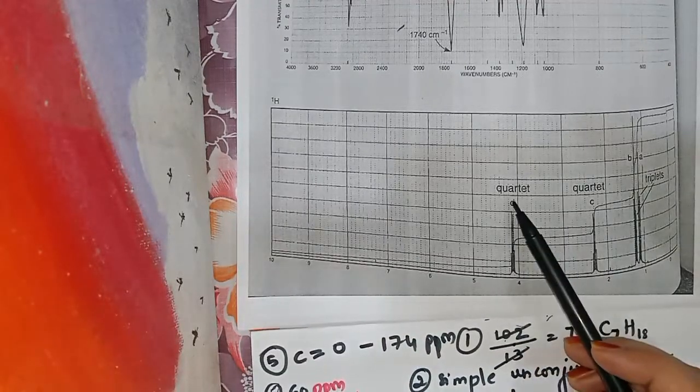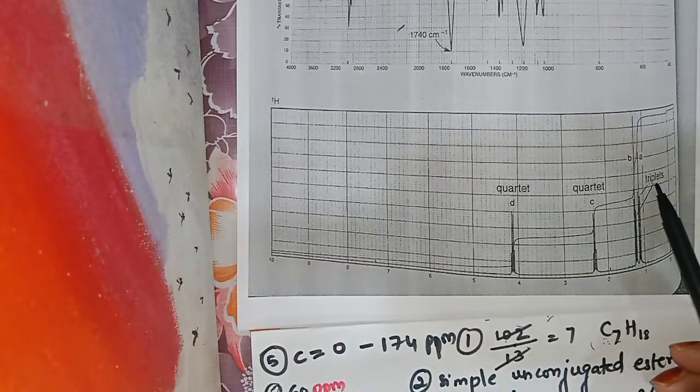We are having a quartet here, and triplets over here.